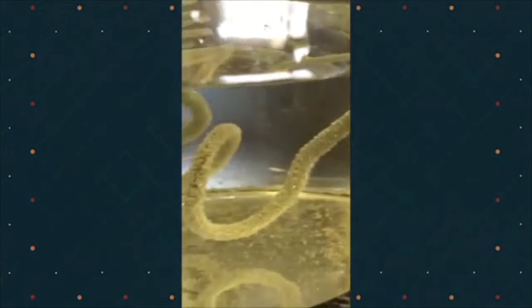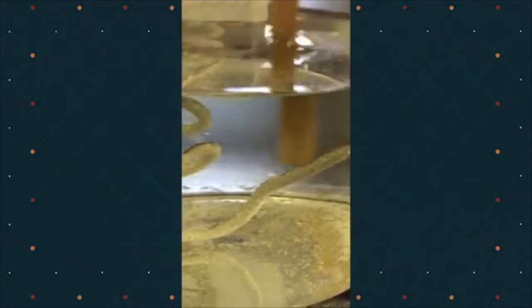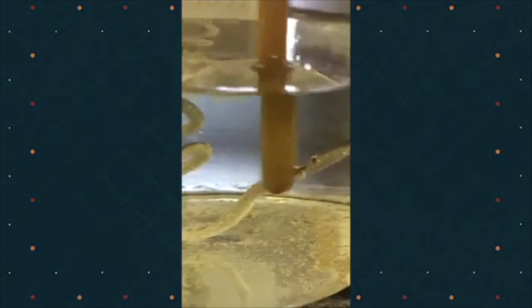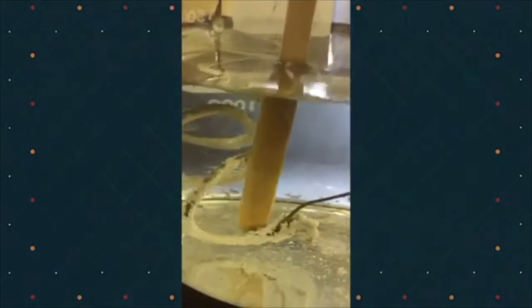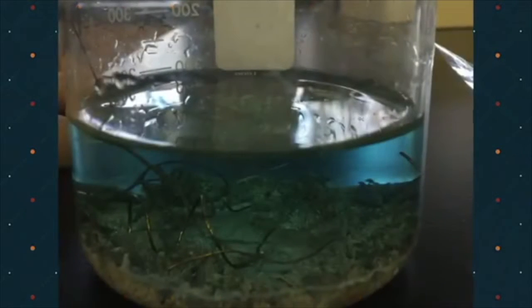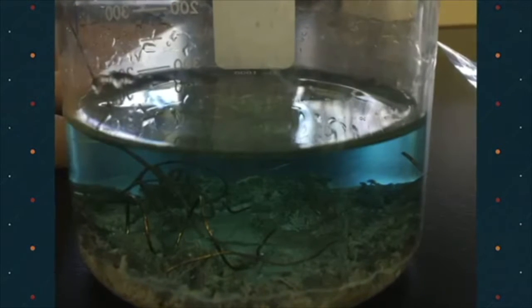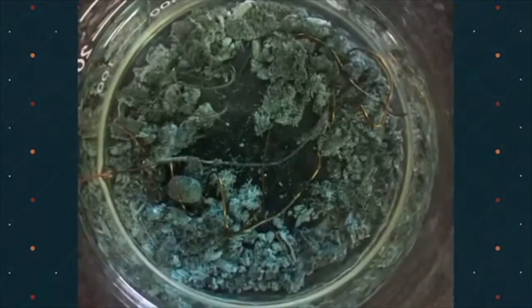After 20 minutes, you'll see even more silver crystals forming on the copper wire. You can see the silver crystals are easy to break and really fun to watch. After a day or 2, the bits of copper wire and gray silver chunks are in the bottom. The liquid itself changed its color from clear to light blue.